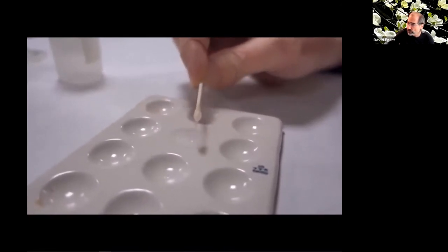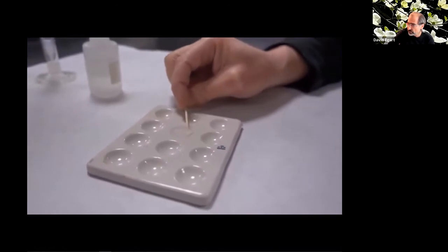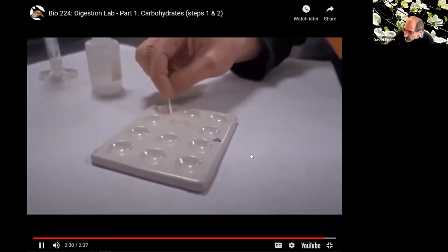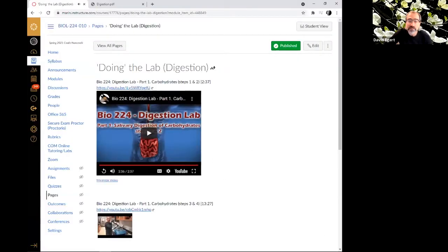So imagine trying to swallow a bunch of cracker dust. It wouldn't really work. So this is what makes a nice slippery ball go down your esophagus. If you look in detail, totally cool gooey goop in there. All right, that's the first part. Again, you should observe and write your observations, which is what we just talked about. I showed you with genuine cracker dust, which I ended up cleaning up over break because I spewed it all over my desk.